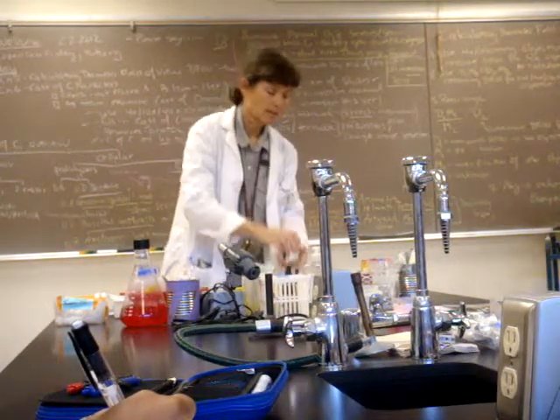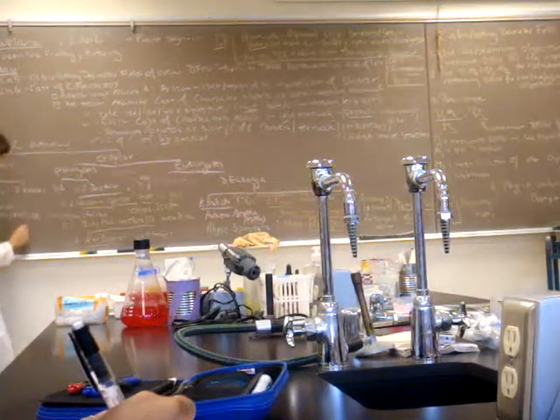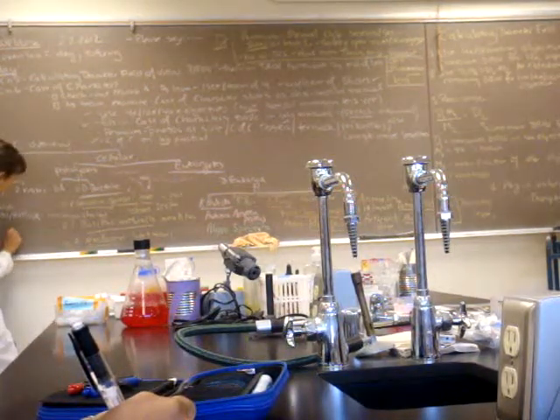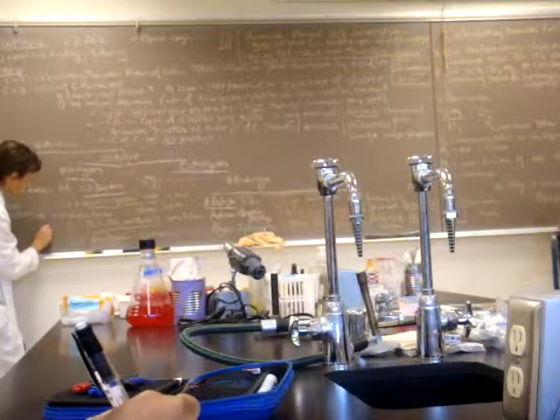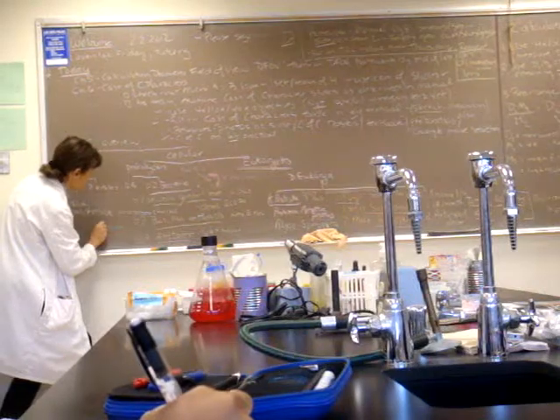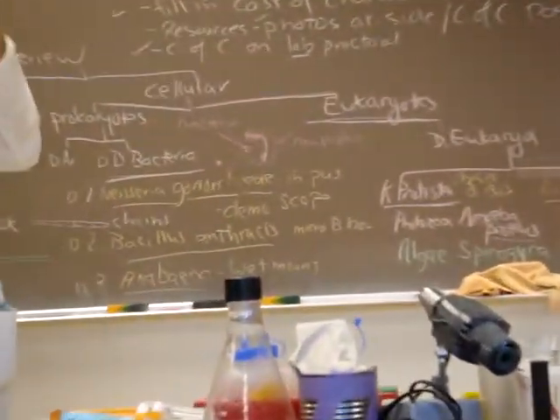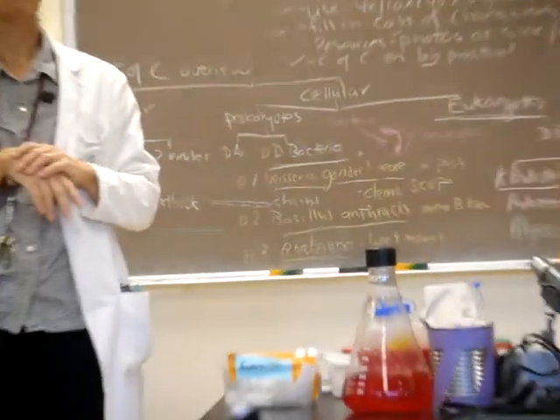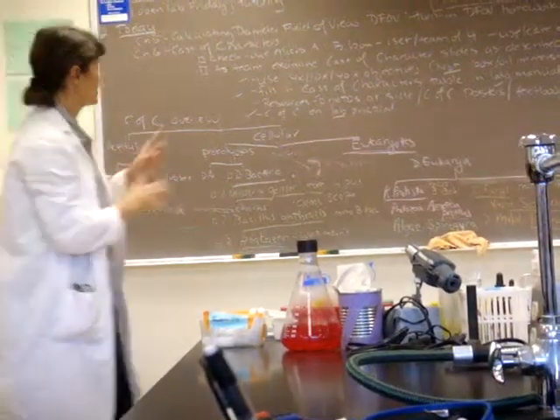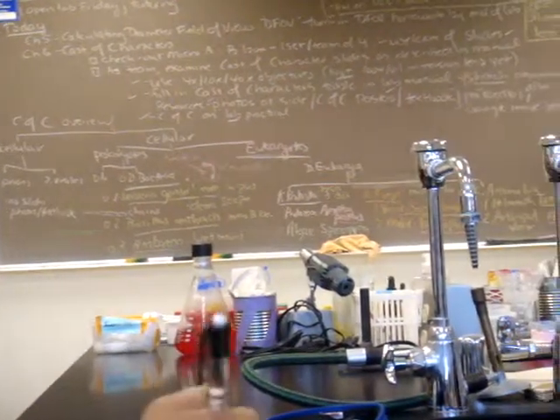The Anabaena that we saw yesterday were forming these beautiful chains of cells, so very thin, very delicate. And instead of being round like the Nostoc, which is what I was expecting, they're more rectangular. So you see these delicate little green hair-like filaments of these chains of Anabaena. Beautiful stuff. Okay, right. So that finishes our prokaryotes.